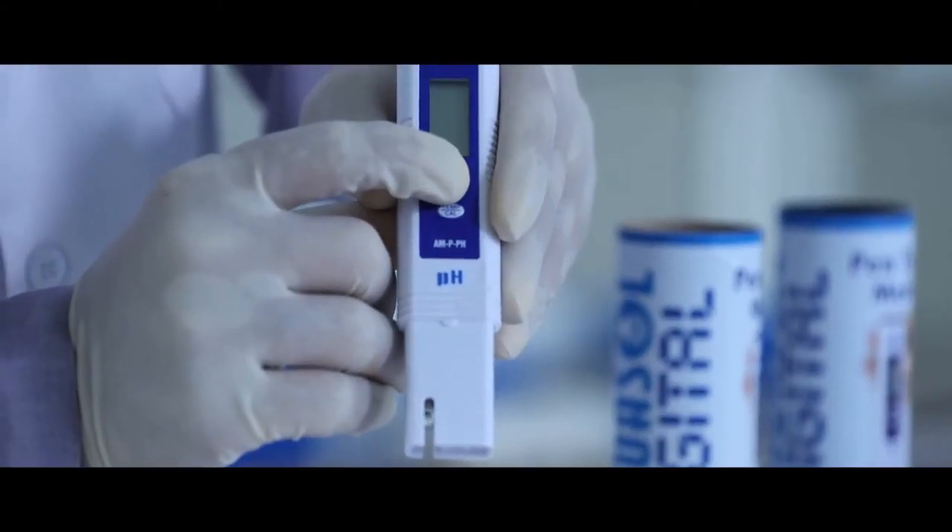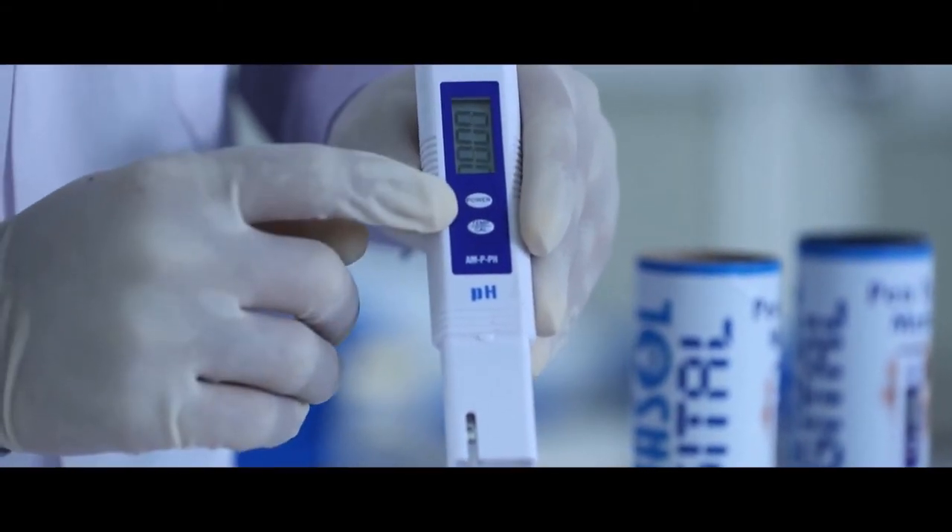Similarly for pH, press the mode key for pH mode.